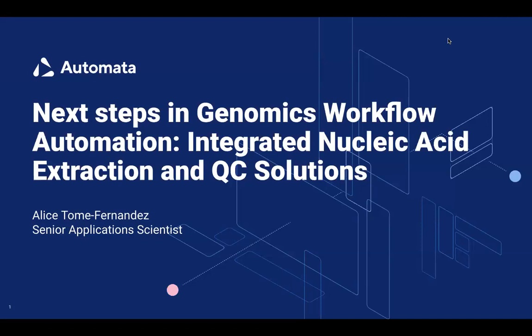So this is our Automata hosted webinar on next steps in genomic workflow automation, integrated nucleic acid extraction and QC solutions. My name is Alice. I'm a senior application scientist at Automata. My role in the company is to work with customers, look at their protocols, understand their requirements, and then translate that into a workflow using our platform.